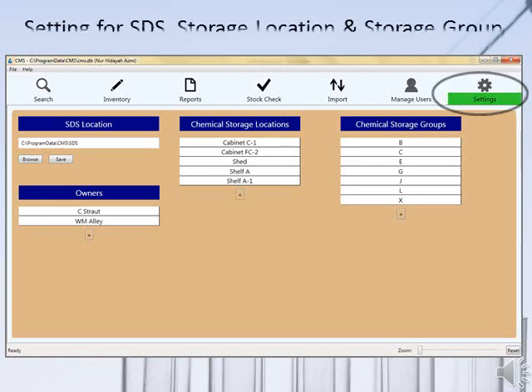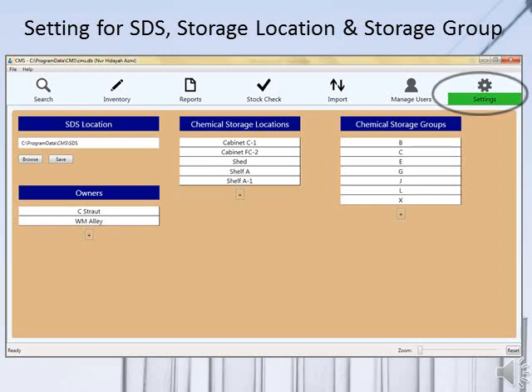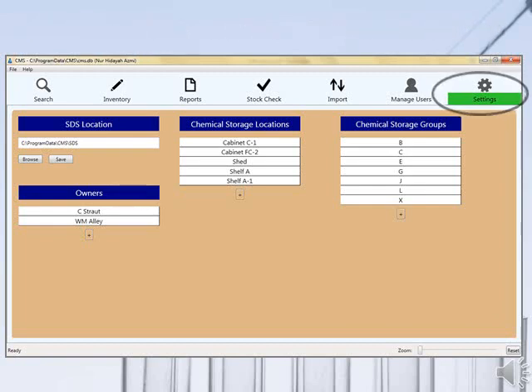In the Settings tab, the administrator needs to properly set up the inventory with all the chemical storage locations, owners, chemical storage groups, and SDS location. As mentioned before, only the administrator can fully control the inventory in the CMIS system, and therefore only the administrator can access this section.